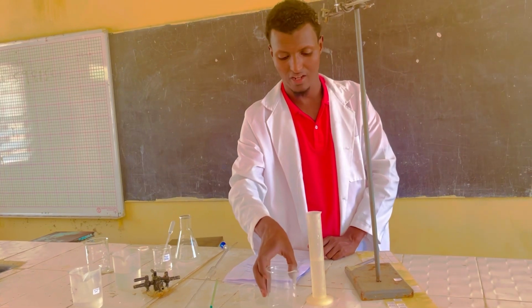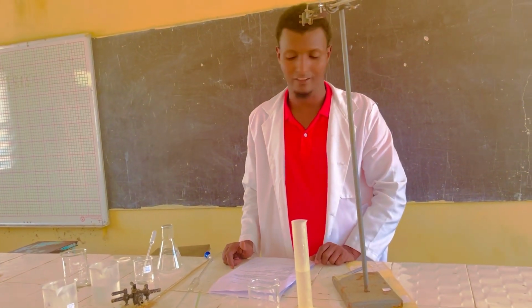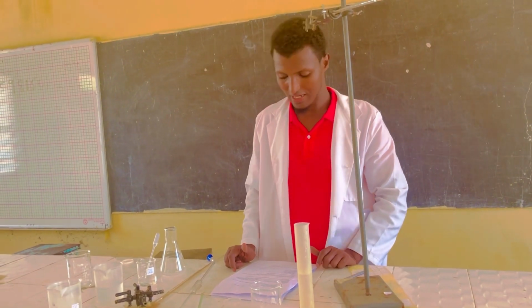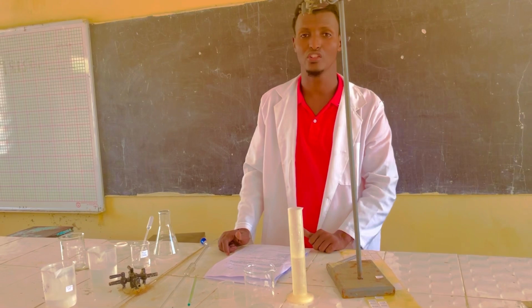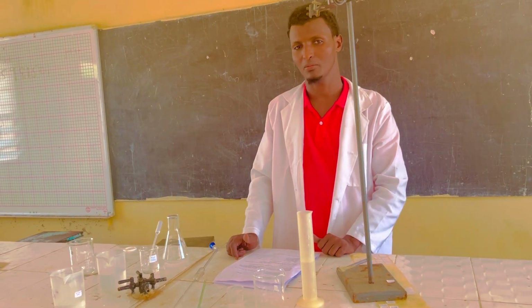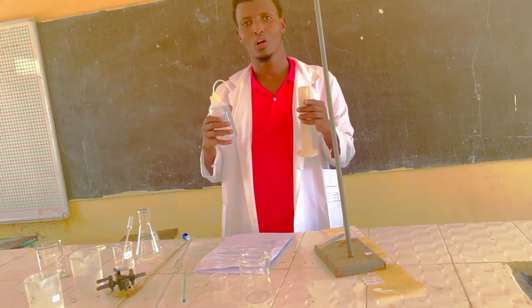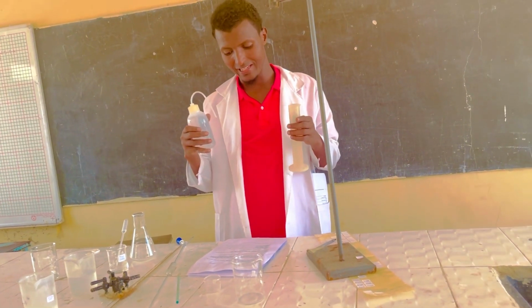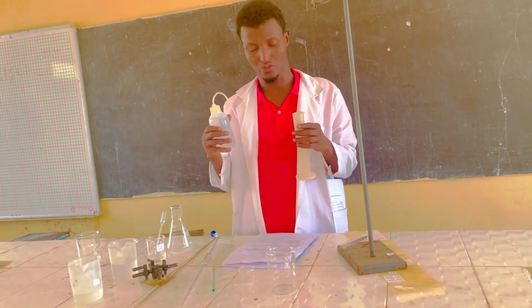So I transfer the solution into the 100 ml measuring cylinder, and I'm going to add distilled water to make 100 cm³ of the solution.